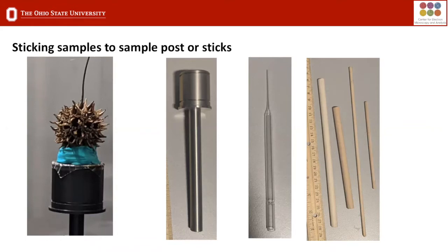One of the aims when you're mounting your sample is to make sure whatever you're mounting your sample on has the same diameter or slightly smaller than your sample. If you mount the sample on a post that has a larger diameter, you're basically increasing the effective size of your sample, and this will limit the voxel size which you can achieve in your full field scan. Usually if I have a sample size of 8 millimeters diameter or smaller, I would use super glue and not double-sided tape to attach it.